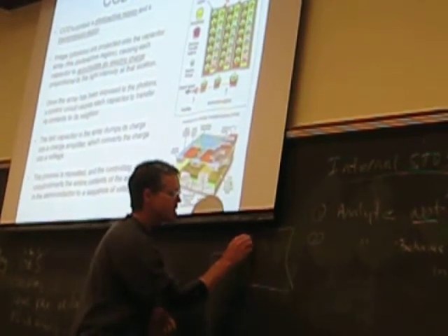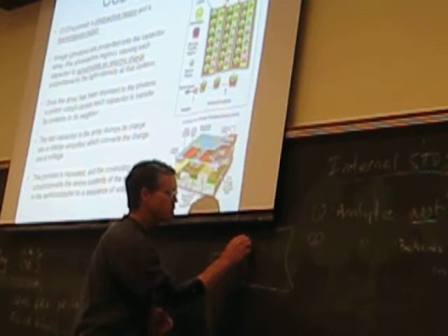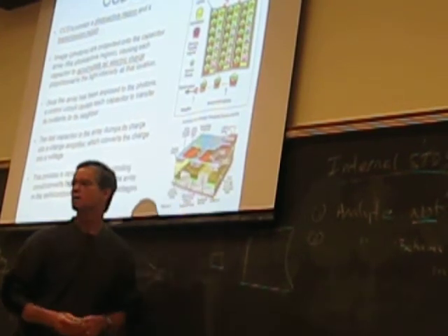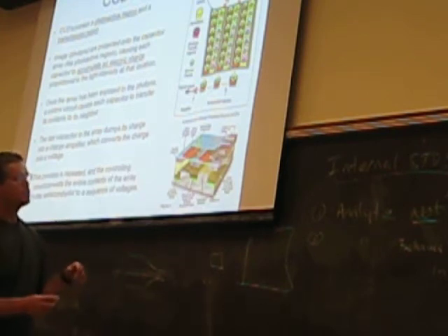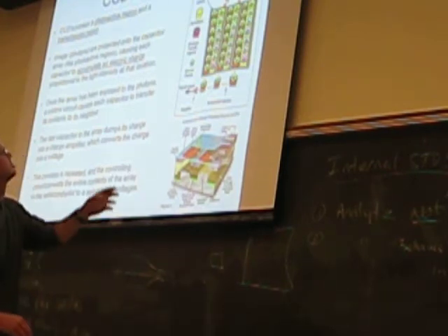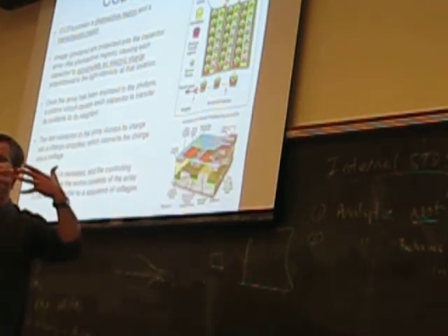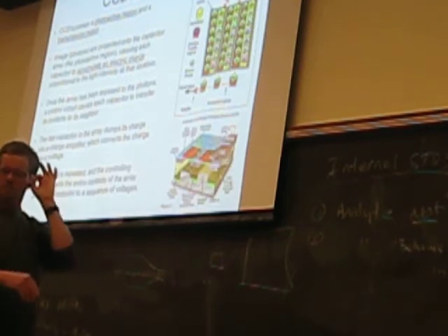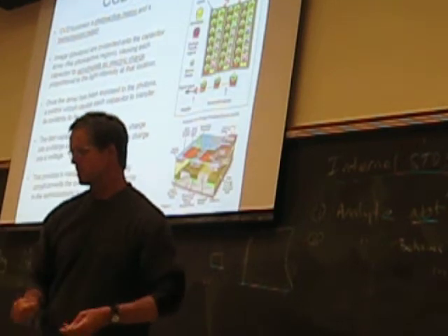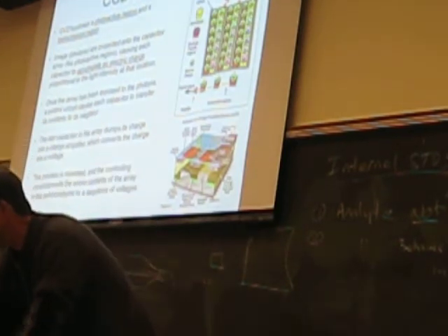And they transfer those electrons into a register that then ultimately gets passed into an amplifier and amplifies the signal. So you can think of it like literally a map of pixels on a screen that are each capable, in each pixel position, of collecting photons and generating an electrical potential, which is what they do.